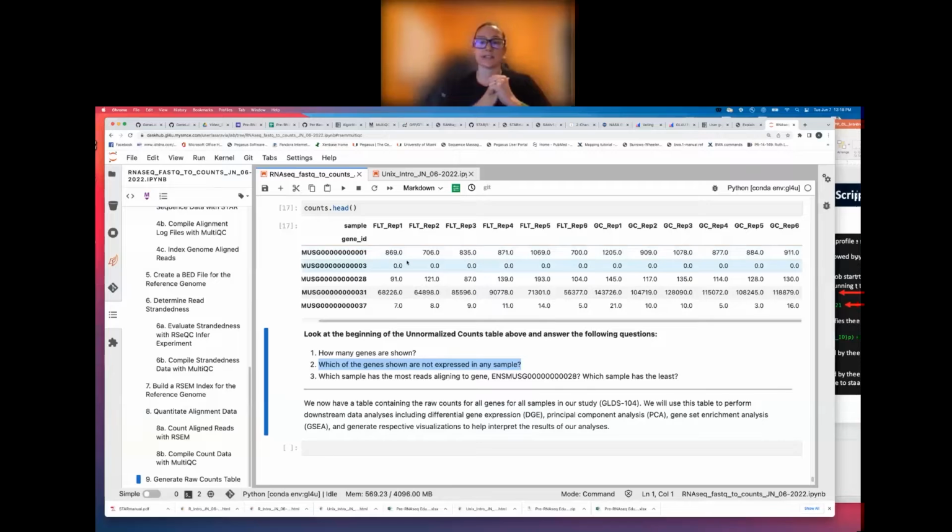So right now, this is our raw counts data. So we're just looking at every single annotated gene we have, how many templates were found from each sample that mapped to that gene. And so we haven't filtered this at all. We're just telling it to report it. Does that make sense? Or is that so confusing?